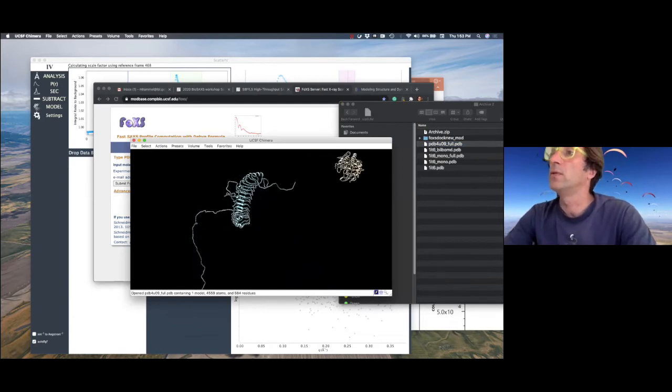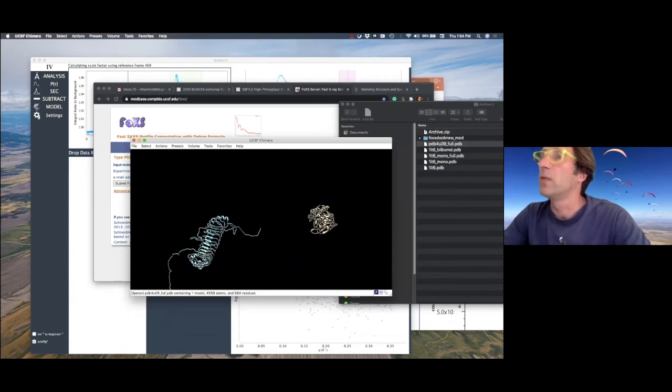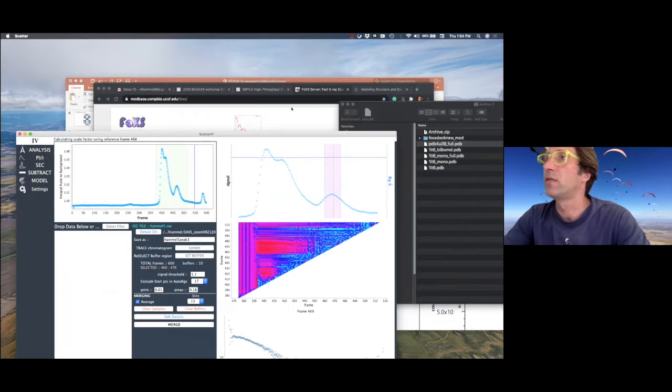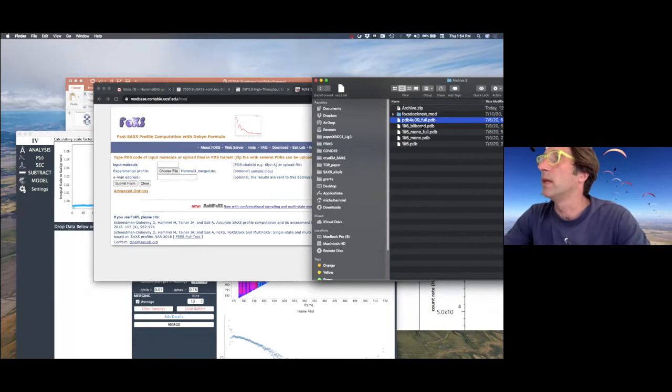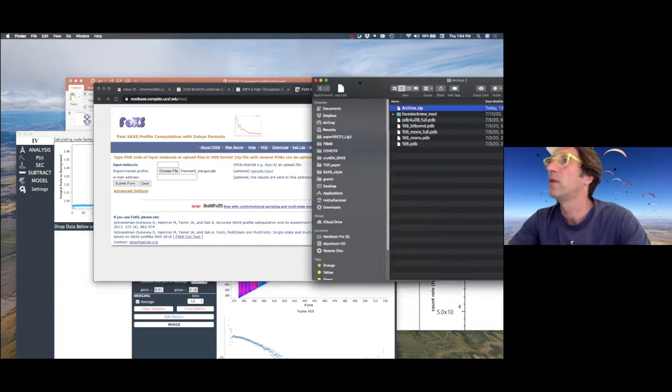So we have a tool and they make a complex. That's what we're expecting. And we want to see which one this peak in the back is. Is it the first one or the last one? So what I will recommend is we take all those PDBs that we expect to have in our solution, if we know those, and archive or zip them and put that together. And that's where you put your zip PDB files.